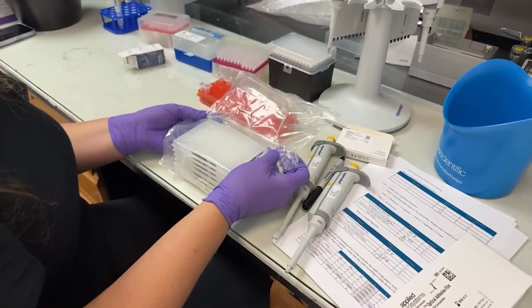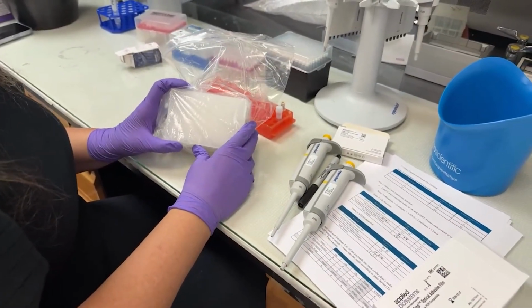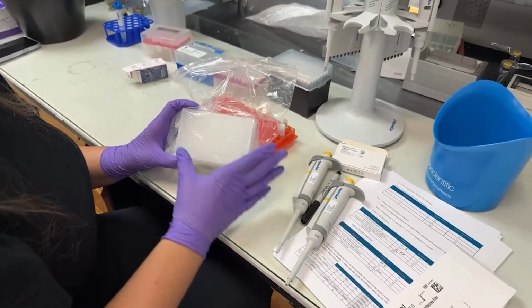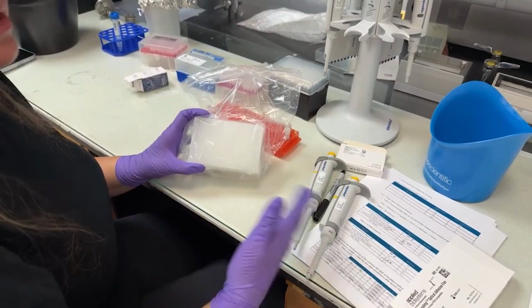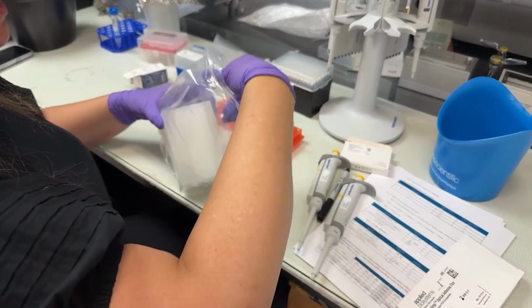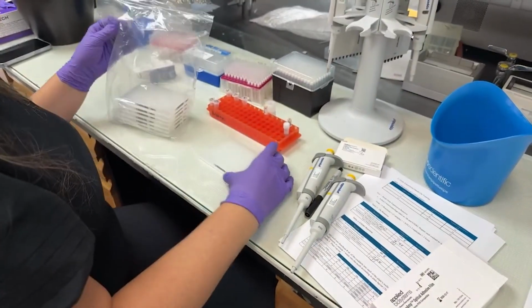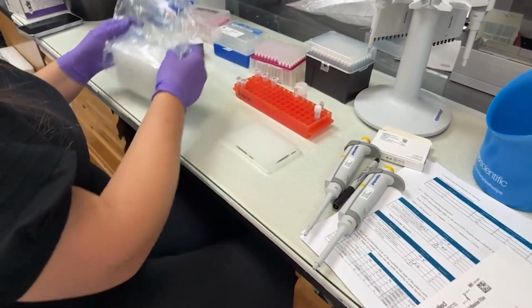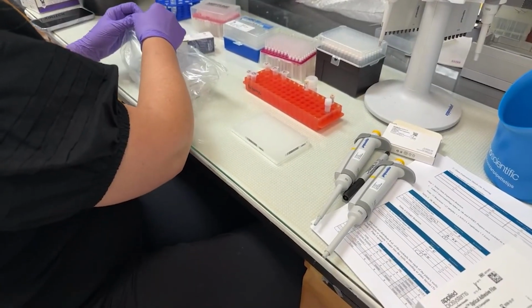These are the 384 well plates. It's the same size as running 4 96 samples, so 96 times 4 is 384. The individual wells of those 2 formats are different sizes, so make sure you check that table I showed you earlier about which size reactions go in which instruments.